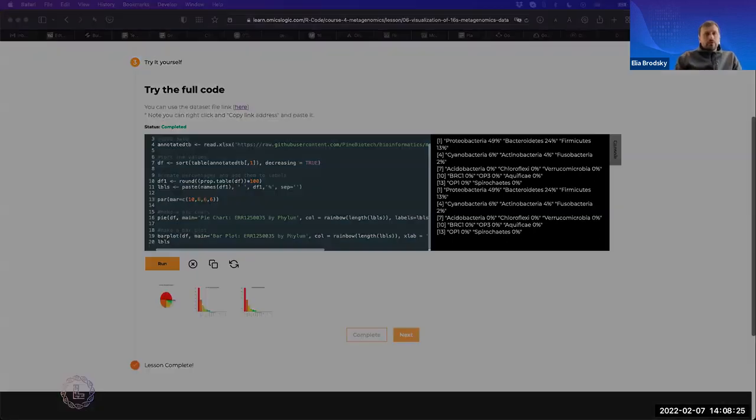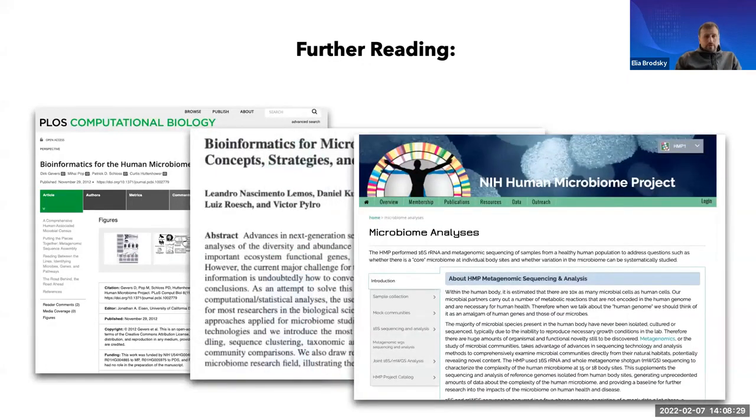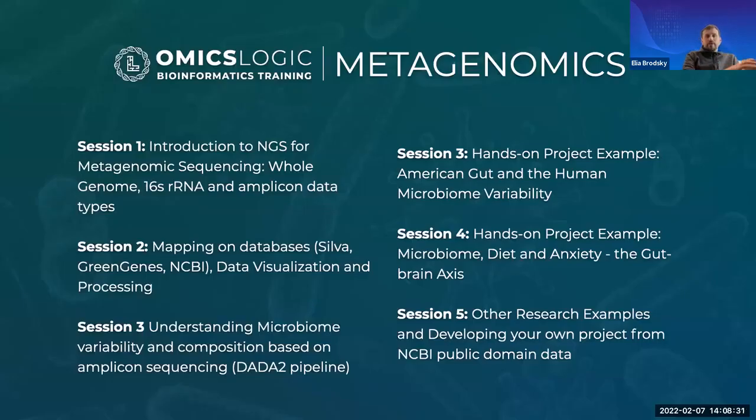Now, moving forward, inside the actual tutorials, you will find these different additional resources: an overview of sequencing, methods of analysis, different project examples, including some exercises that you can do. And then hopefully after you complete that kind of training, you will be able to apply this to a data set of your own.